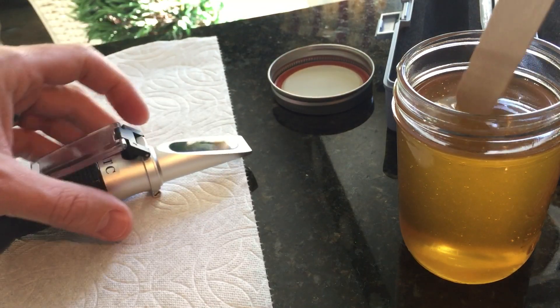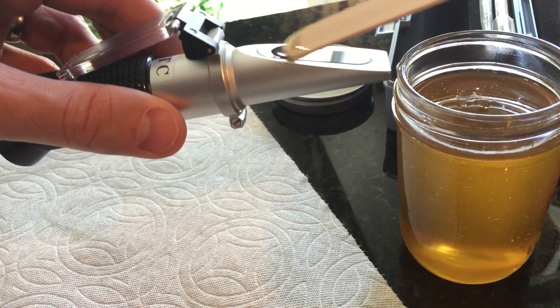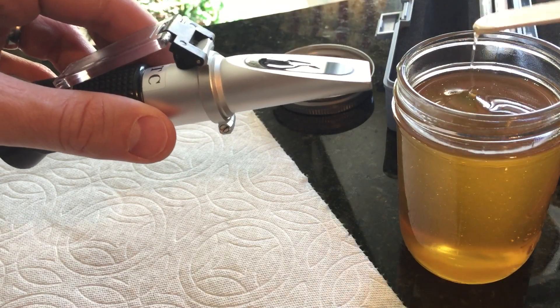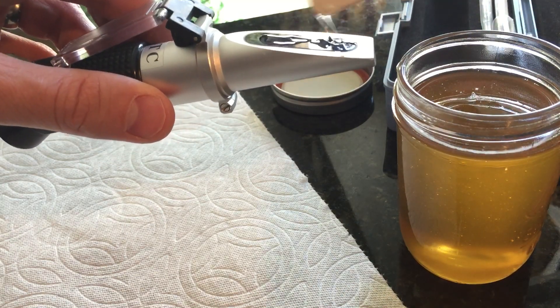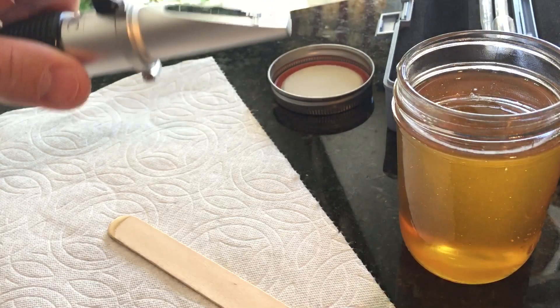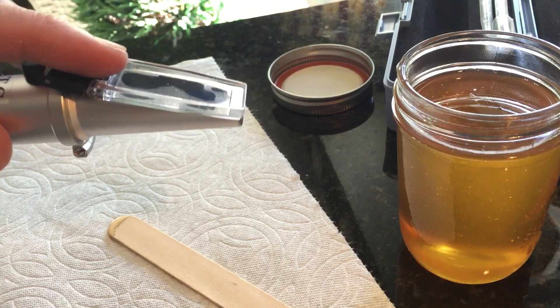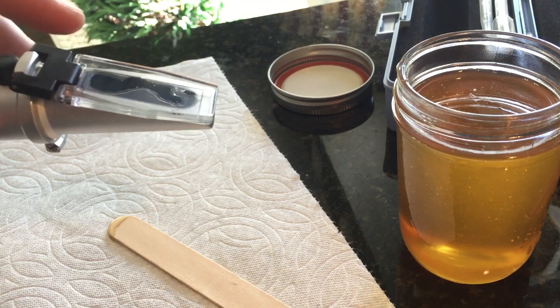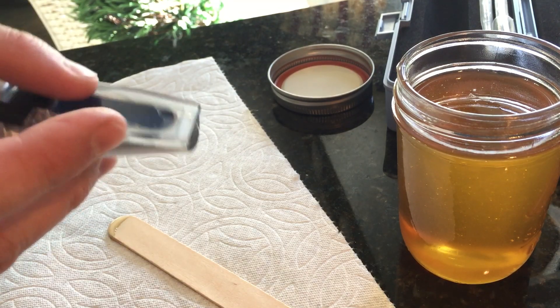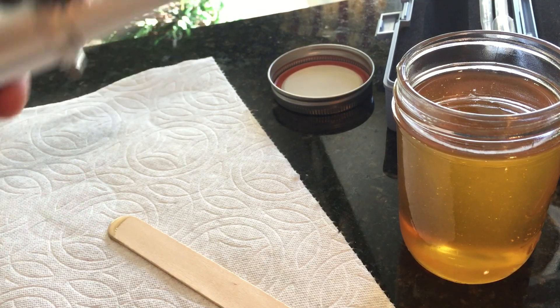Take the popsicle stick here. Nice and thick — put it on the surface here. Drop the lid. You can see it pressing and flattening it all out to get the honey all over the slide surface. There we go, nice and even now, and we'll peek in and see what the moisture content is.